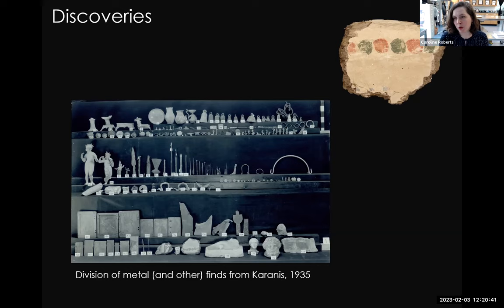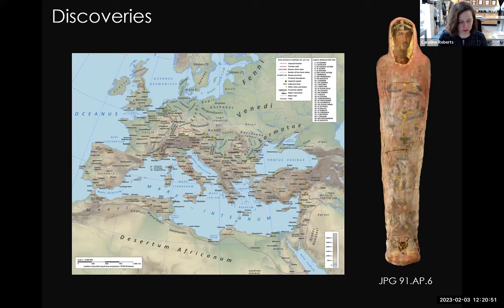So how do we actually explain the presence of this element in the green dots? Well, after doing some research, I learned that chromium can actually appear in naturally occurring green earth deposits. And chromium has been seen in green earth painted on objects from different parts of the ancient Mediterranean. Now, this has opened up a whole new set of questions for me.